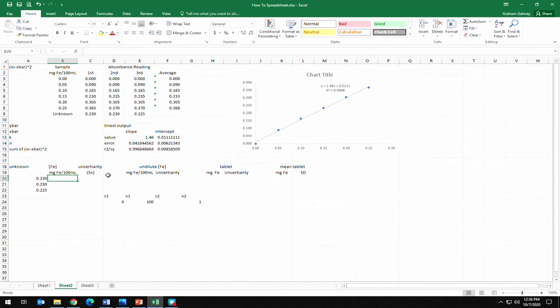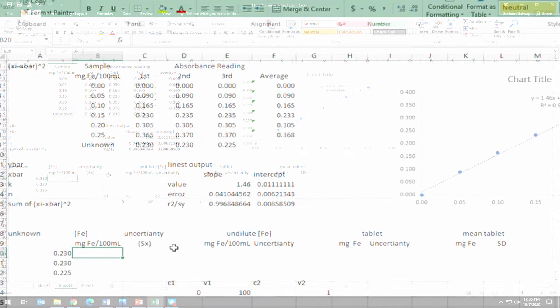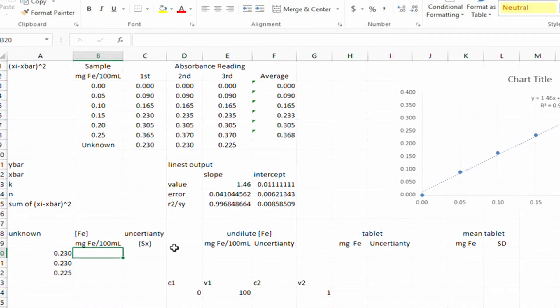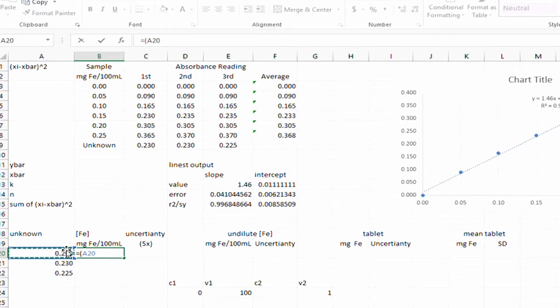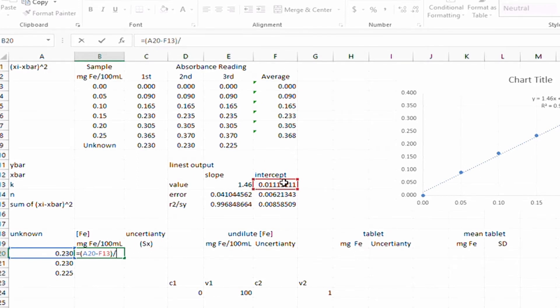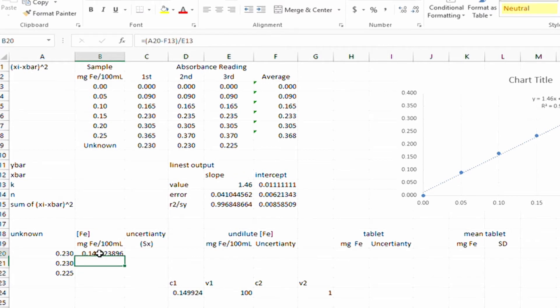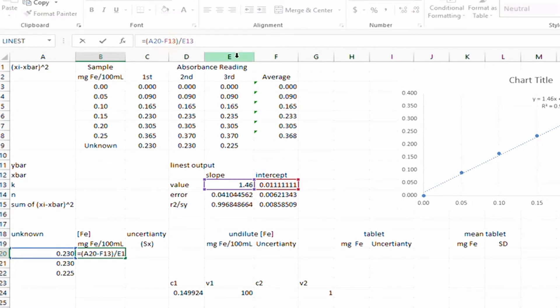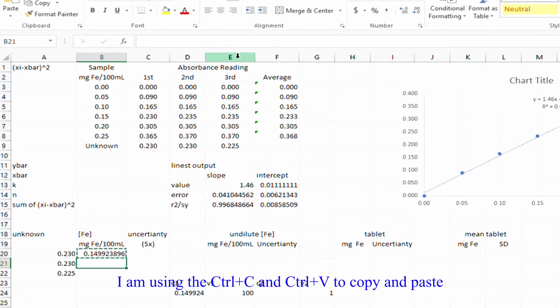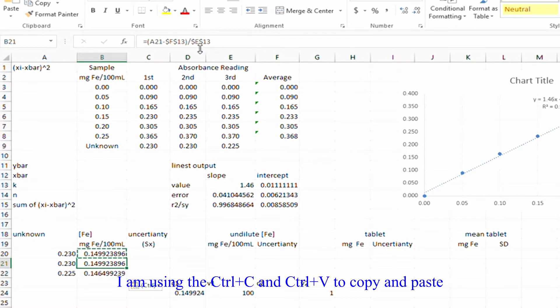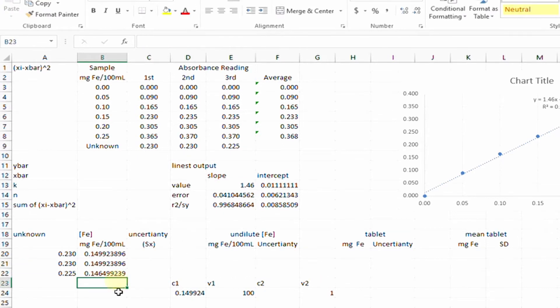Now that we have our LINEST output, we can use y = mx + b to calculate the concentration of the unknown solution. I type equals, open brackets: y minus b, close the bracket, divided by m. That calculation works fine. Going up to the formula bar, I add absolute cell references with dollar signs on the slope and intercept cells. This changes nothing to the calculation but allows me to copy and paste the equation so all three unknowns use those same slope and intercept values.